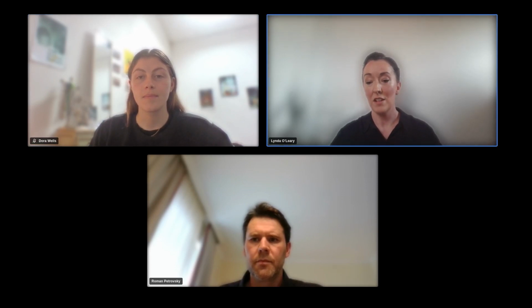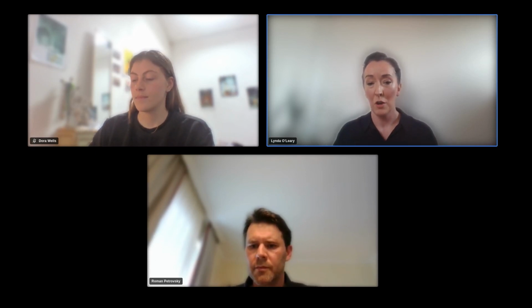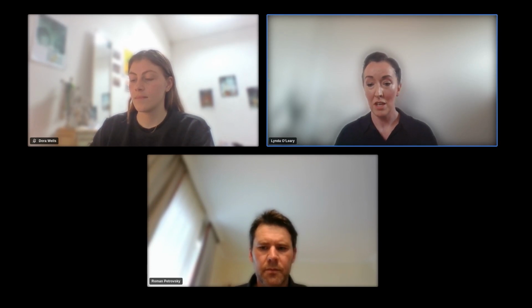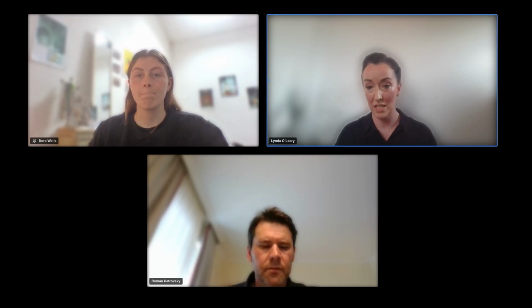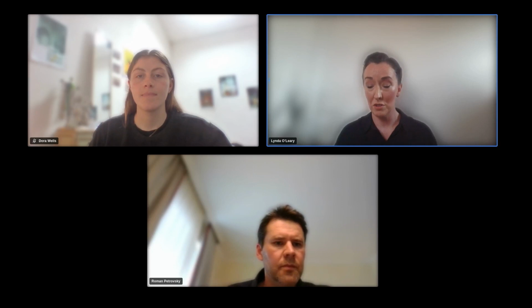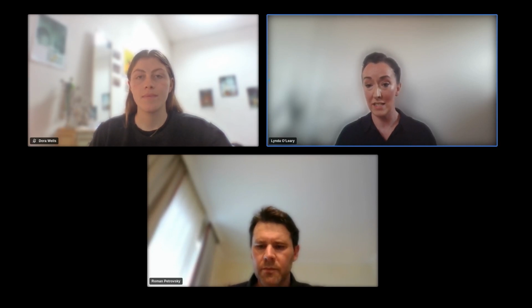It seems like these capabilities will ultimately generate huge amounts of data. Have you made improvements to the data storage piece of the software? So, of course, when you want to do a lot of Z-stacks, that means more data. So one feature that we did here is because we are analyzing the projected image, you do have an option that you can immediately disregard or delete your individual Z-stack images if you don't want to do some further analysis later on down the line. So that would already help with that.